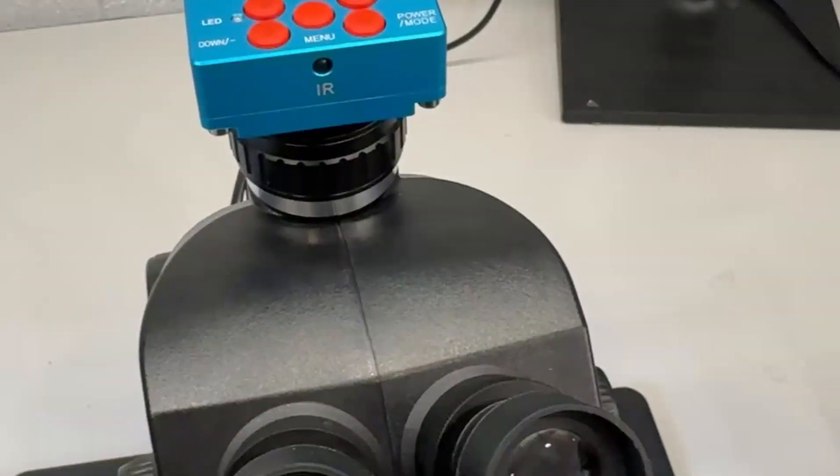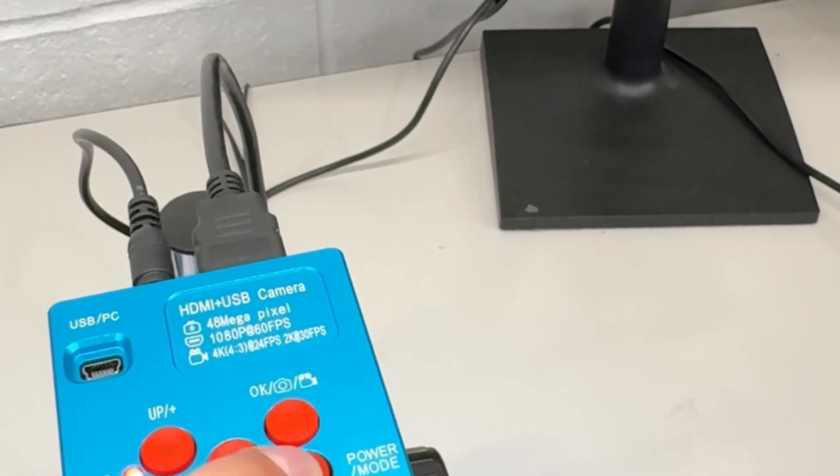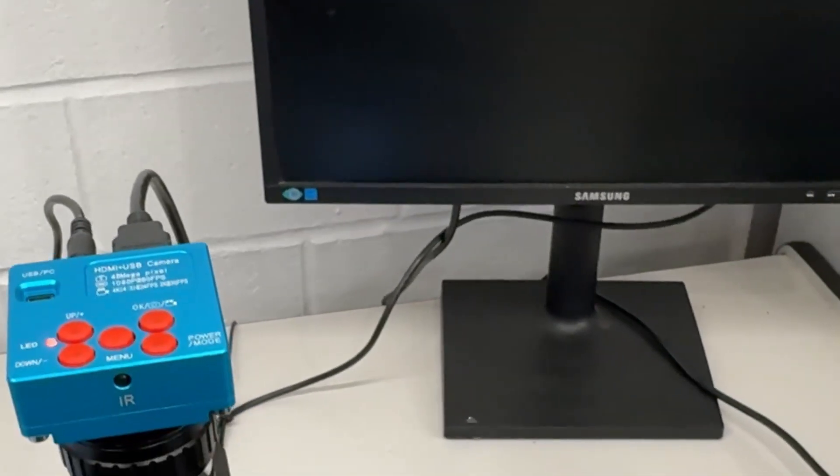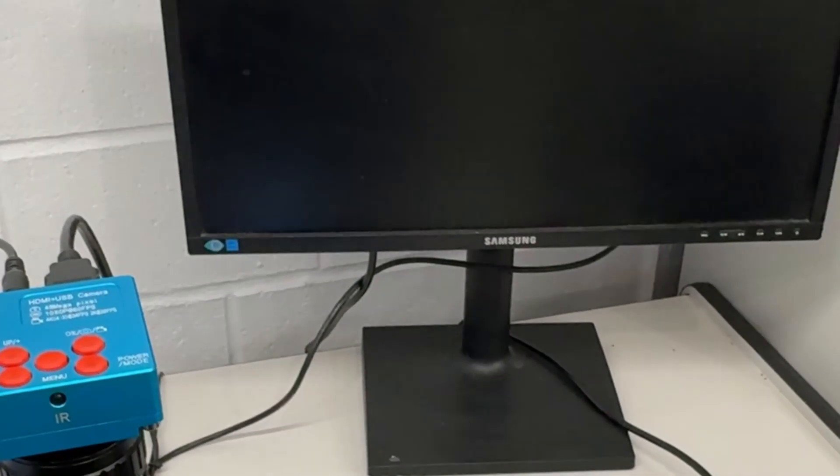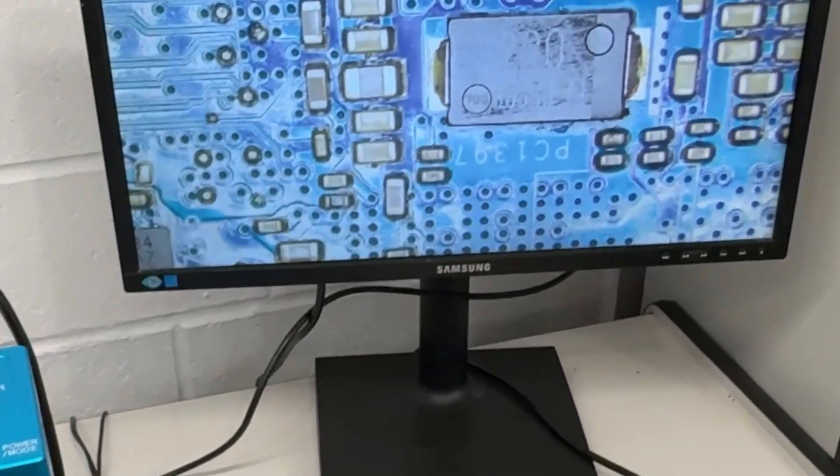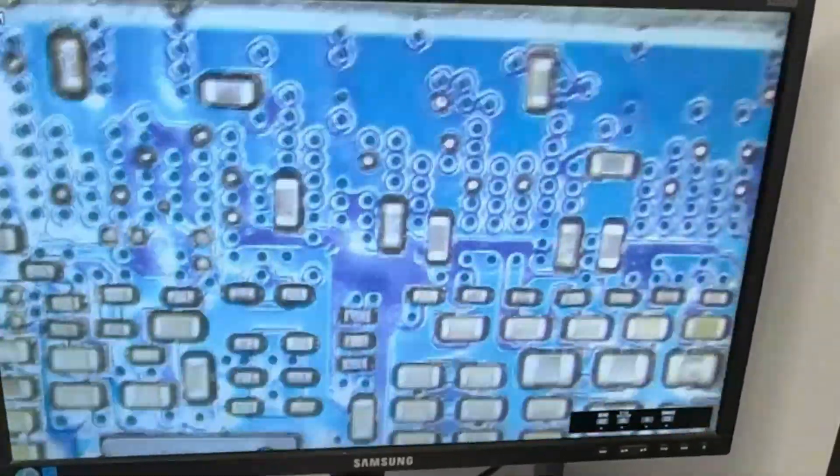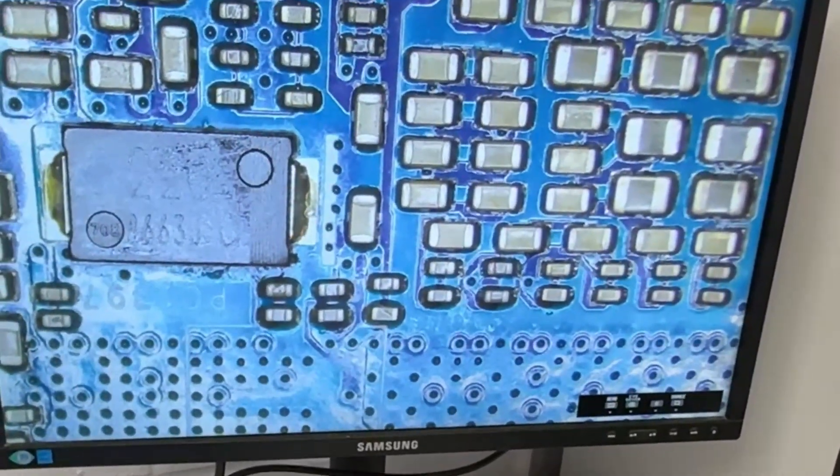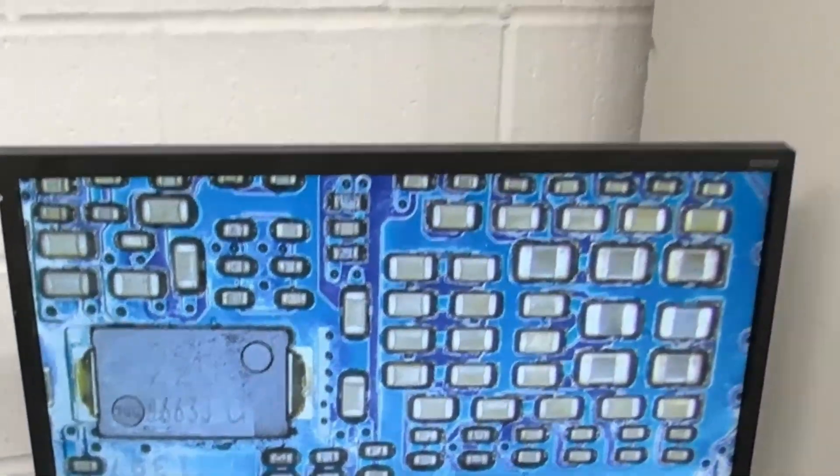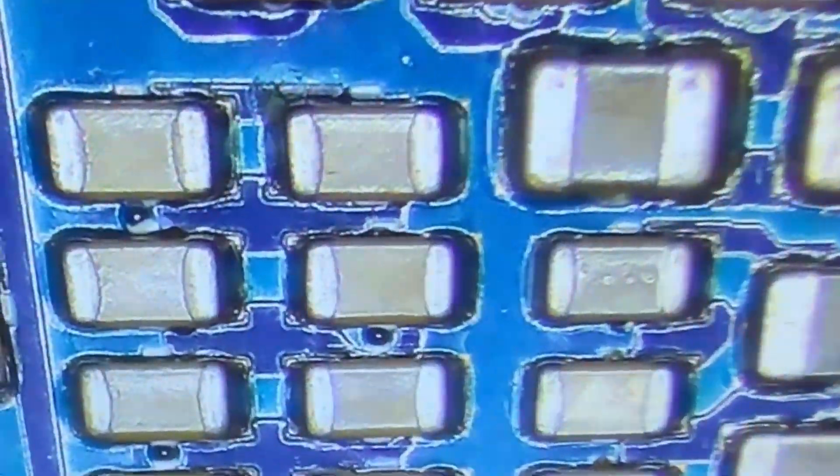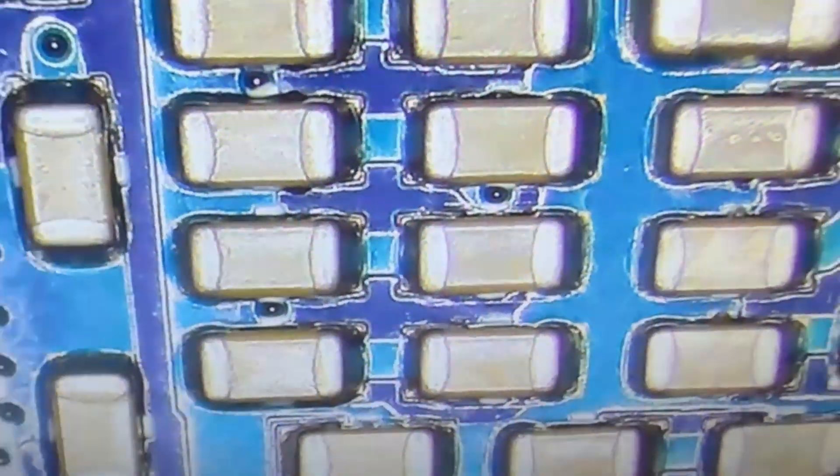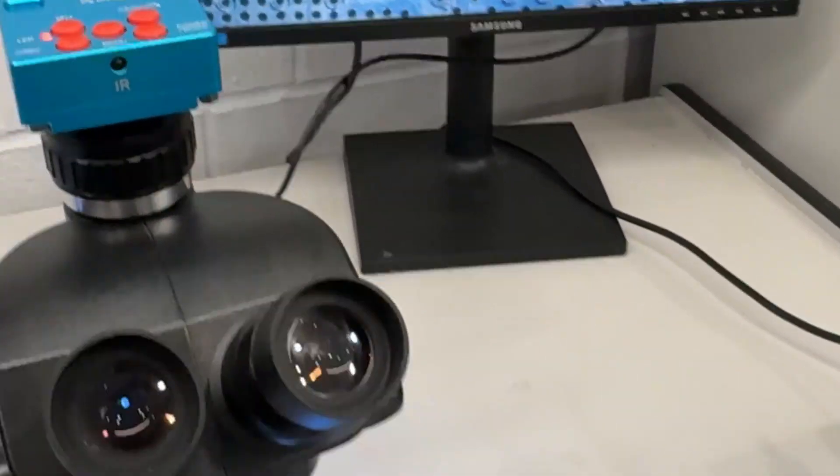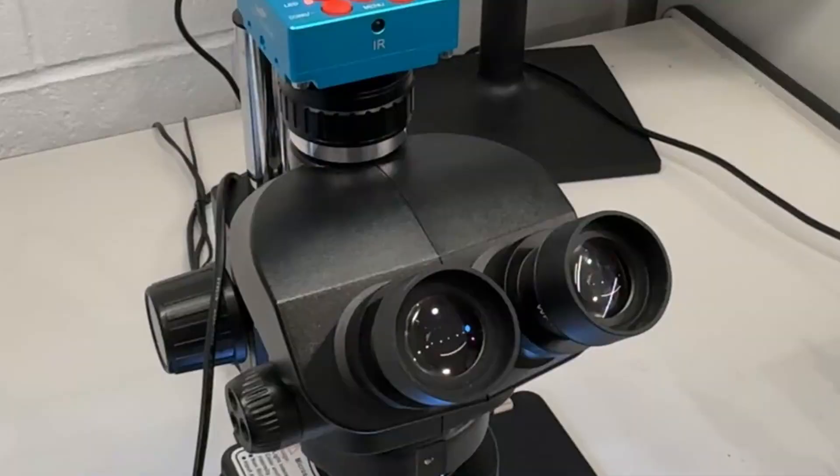What works really well is the camera. If I press the power button you'd hear the three beeps, and in a second you'd see the display onto the monitor. And there you go, really nice and crystal clear result on the monitor. As you can see, it's an amazing view and you can easily get some work done here.